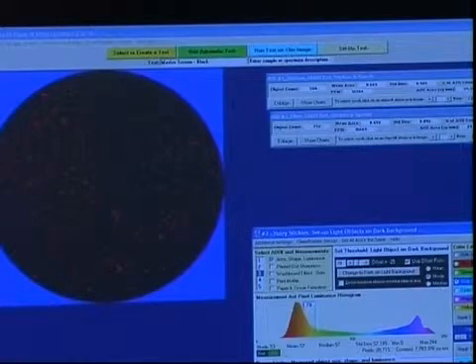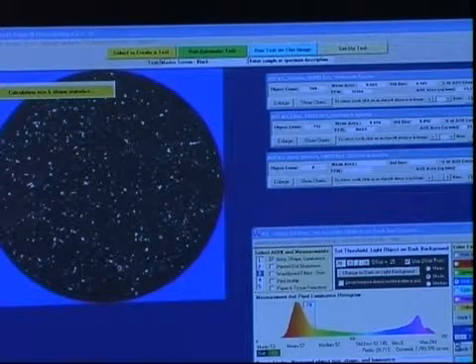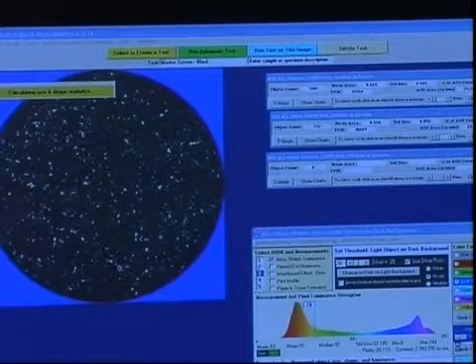hairy stickies. These, 0.08 is a minimum again. And we're looking at anything that is not round because these are the jagged fiber. But the luminance value is brighter than just the fiber by itself, so it's 110 to 255. We'll do the measurement again. The filters now become all important on this particular measurement. It's not measuring. I didn't click it right. Here we go. Okay, now we got it started. It will be busy for a while because there are a lot of hairy stickies in there too.